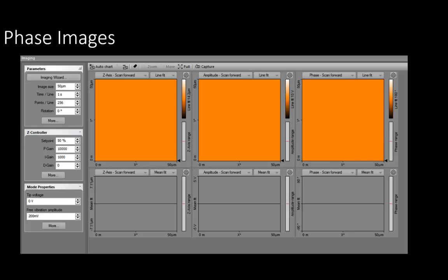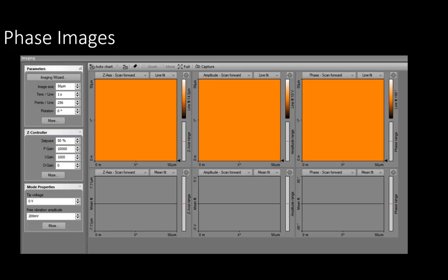There are three imaging windows in phase contrast mode. Set these to Z axis, amplitude, and phase scan forward. Set the feature size, feature height, and scan speed as before and obtain an image. Observe how the three images are different from one another and think of what information each one presents.